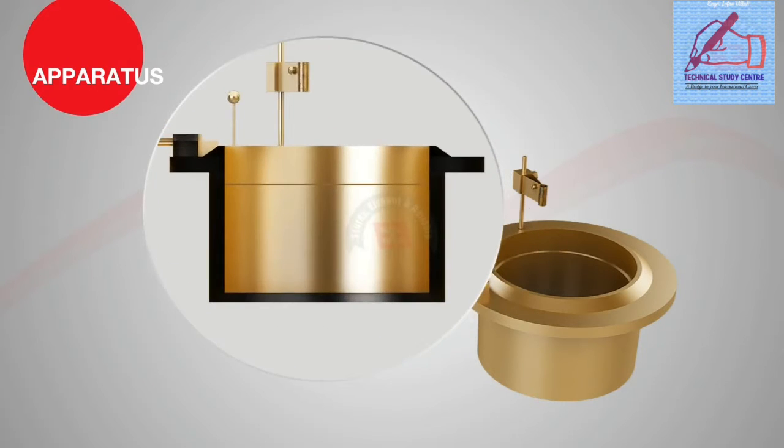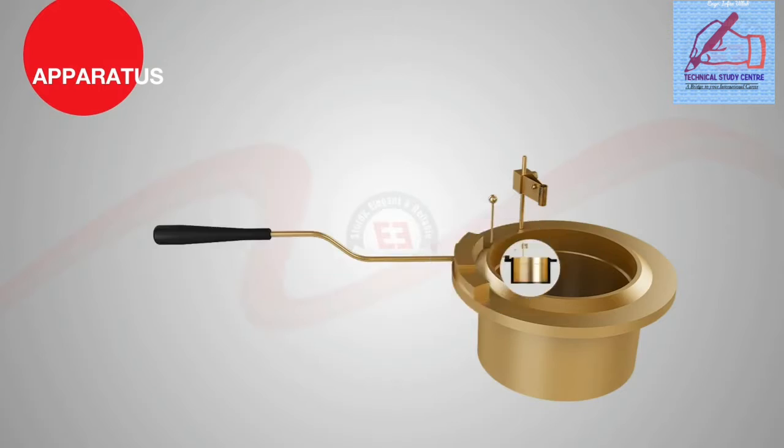The inside diameter of a cup is between 63 to 64 mm. The outside diameter of the cup is between 67.5 mm to 69 mm. The filling mark is between 9 mm to 10 mm from the top of the cup. The inside height of the cup is between 32.5 mm to 34 mm.